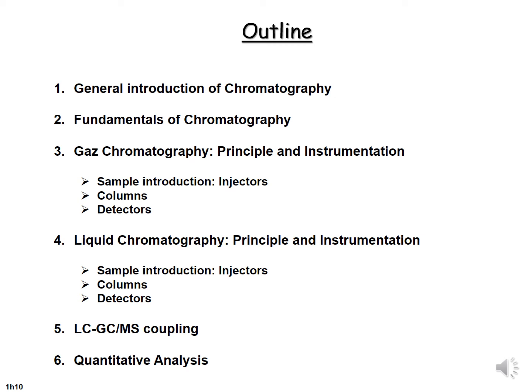Okay, so I have finished the fundamentals of chromatography, and now I will speak about the first big family of chromatography, which is gas chromatography. I will speak about the principle and the instrumentation first. After that, I will focus on the injector, the columns, and the detector.